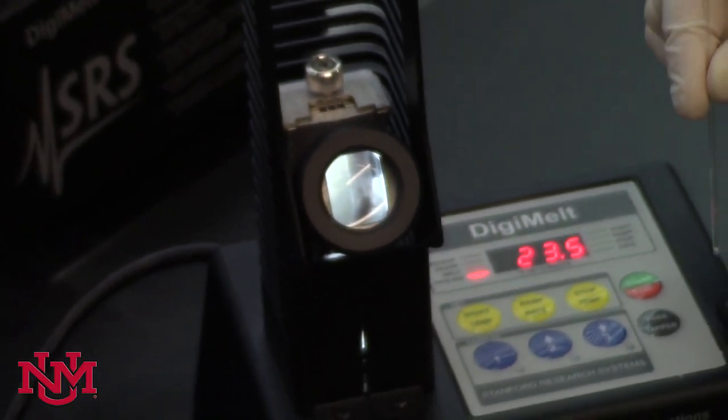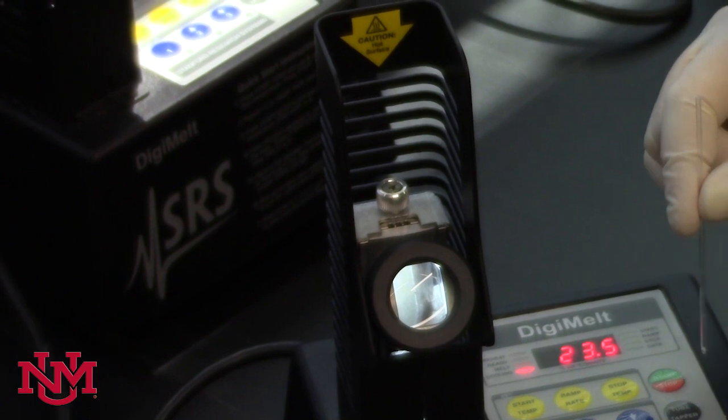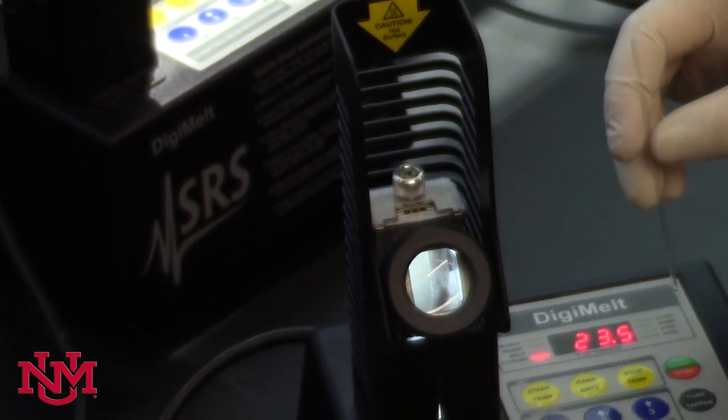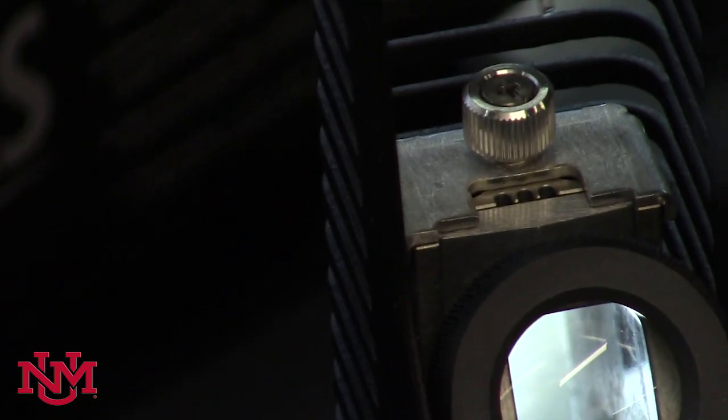Once you have your sample and you've programmed the digi-melt to go ahead and start warming up, then you can come over to the area where we have three little slots and you can put your capillary in there.